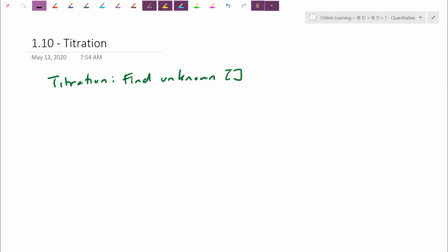The demo that I'm going to do for you is going to be an acid-base titration. The glassware that we're going to be pulling out later on here is going to be a long burette. A burette here has a stopcock valve here. You do want to make sure that it's perpendicular when you load up the solution. The burettes that we have are 50 mL burettes, exactly the same on the virtual simulation. The burette actually has numbers upside down, so the 0 mark is actually up here, the 50 mL mark is down here.